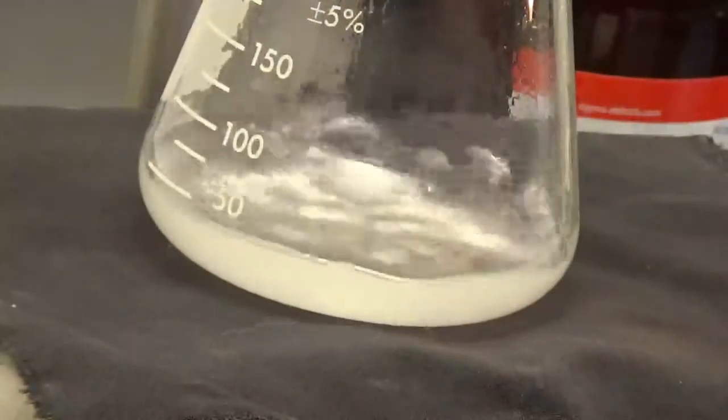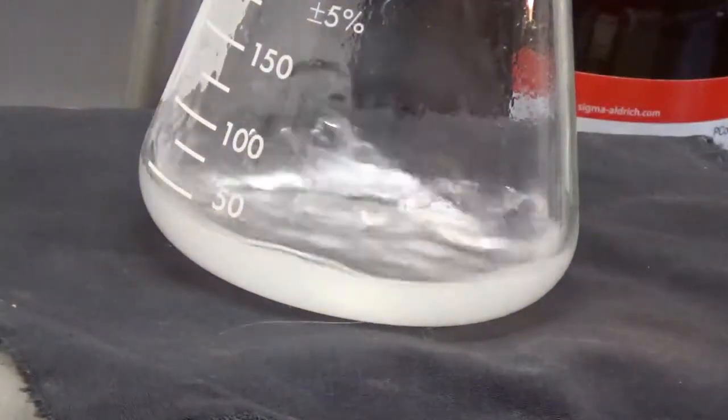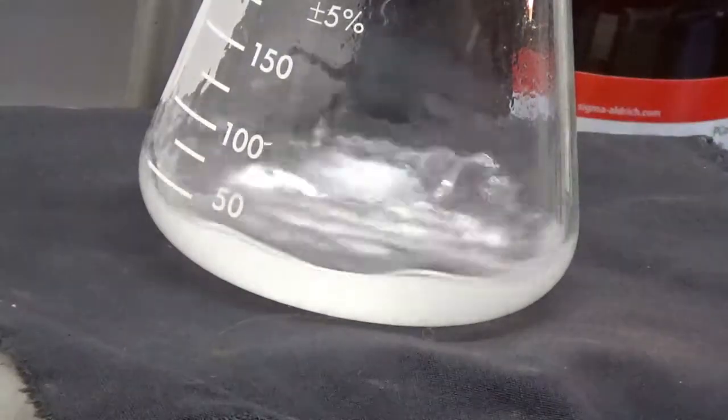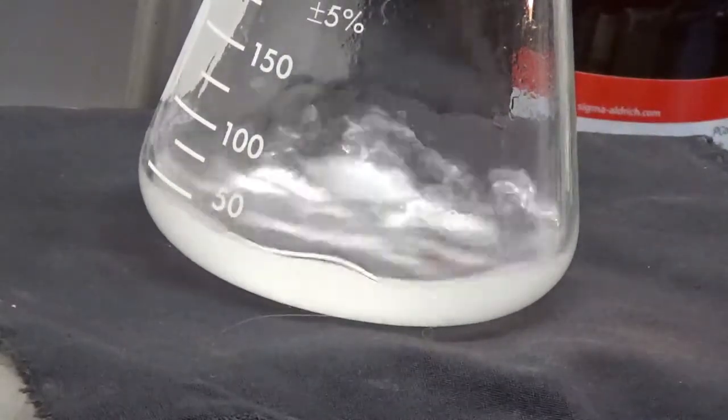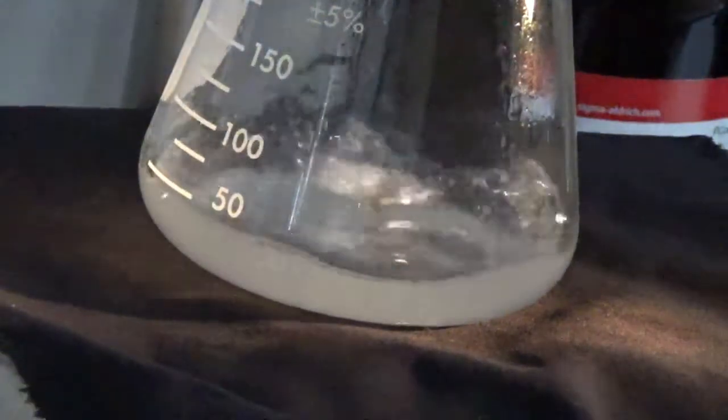Clear from the top, but cloudy from the side, so I would like it to look clear on all sides. So I'm going to turn the light on, put another few drops in. Alright. Light off again. I know this is hard to see. Let's see where I am.